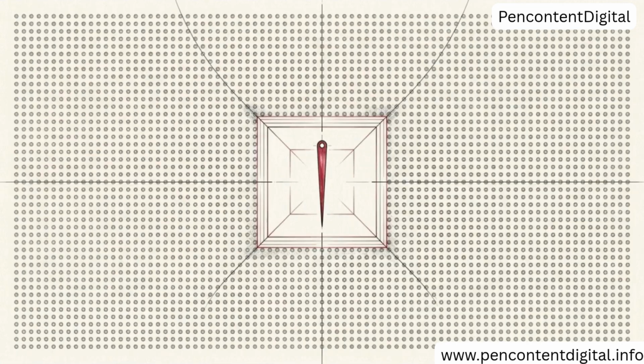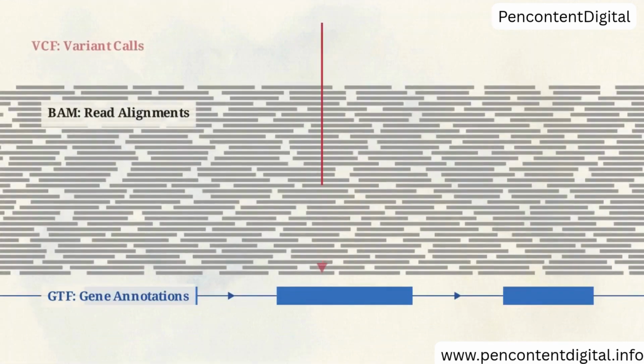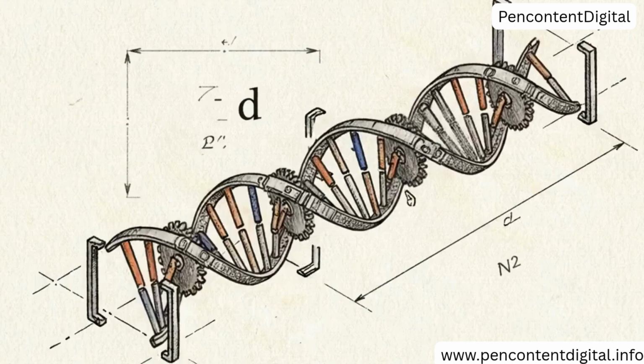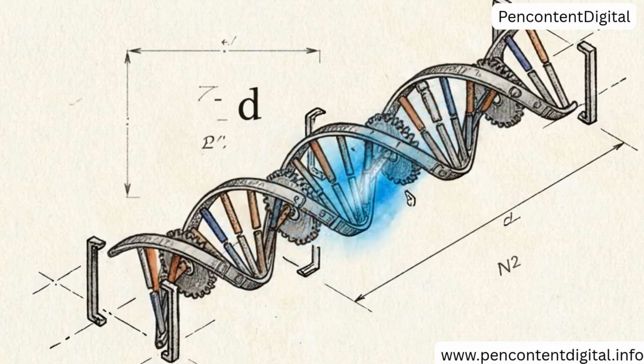We then shift from broad coverage to specific anomalies flagged by variant calling algorithms. These proposed variations are logged in the VCF, or variant call format layer. IGV displays single nucleotide polymorphisms and deletions on this dedicated VCF track, marking their exact position relative to the reads and annotations. A standard practice is cross-referencing every VCF call with raw read evidence in the BAM track. This allows researchers to visually confirm if a variant call is genuine or triggered by poor alignment in the underlying reads. This verification process provides the final check on algorithmic results, using the physical geometry of the reads to confirm the variant.